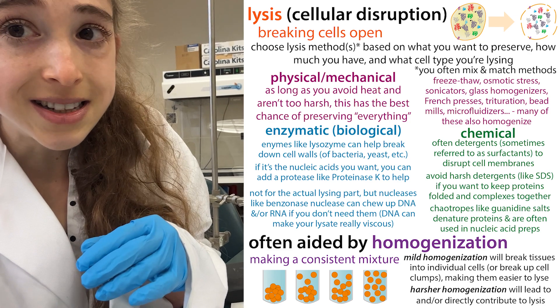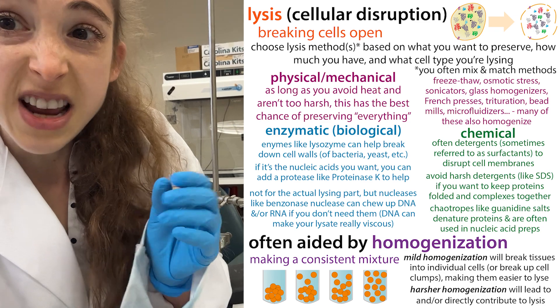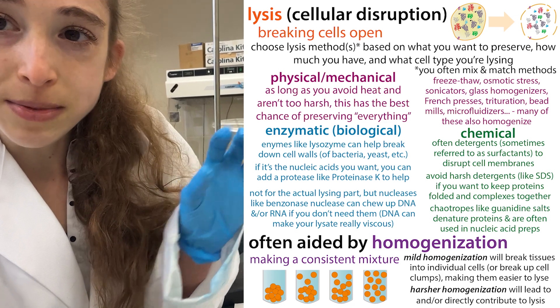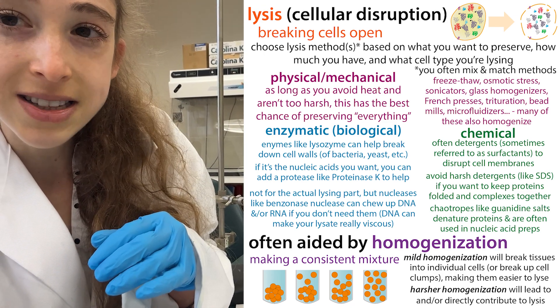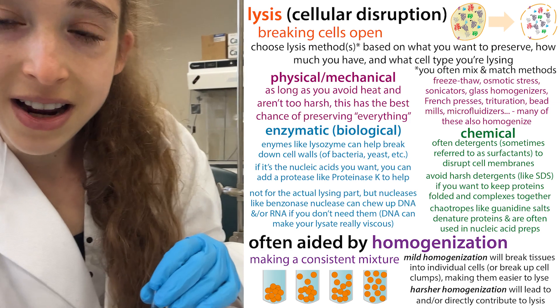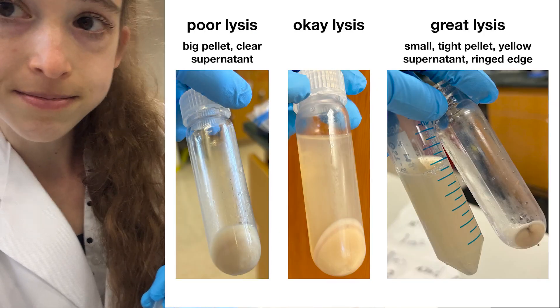Don't overdo it on the lysis — you're going to have to optimize the conditions. I was having a bunch of trouble trying to get a protein to purify, and the problem wasn't the purification itself, it was the lysis — trying to adapt the protocol to different sonicator settings and adding a little more lysozyme. But at the end of the day I was able to get it to work and get some pure protein. So I just wanted to share that tip: look at your pellet.